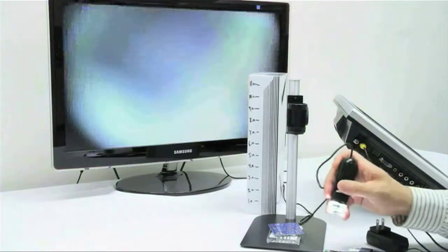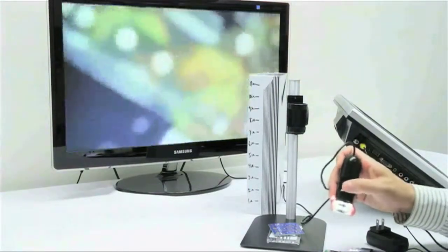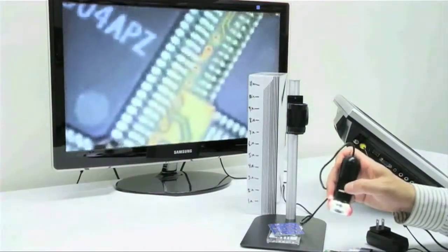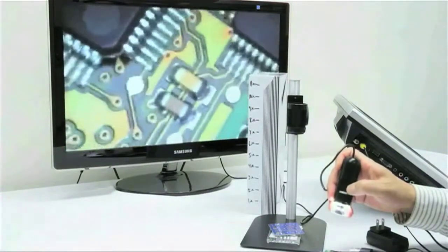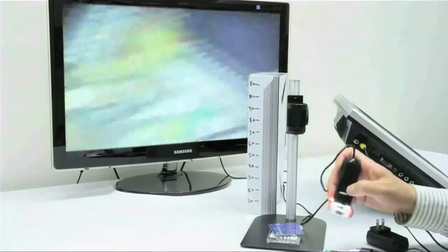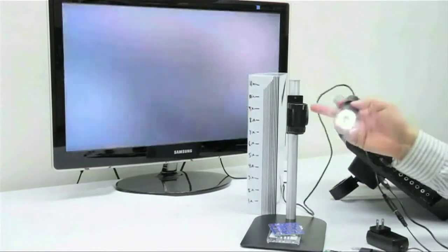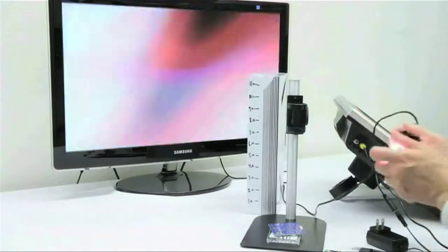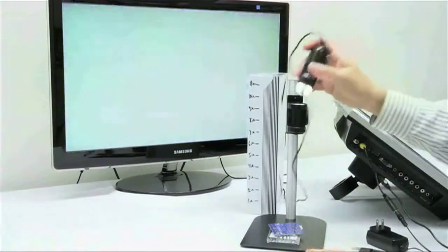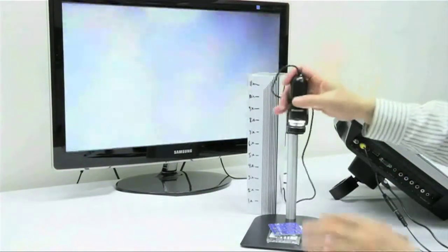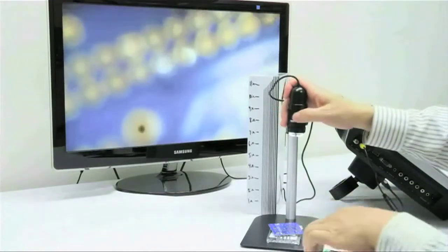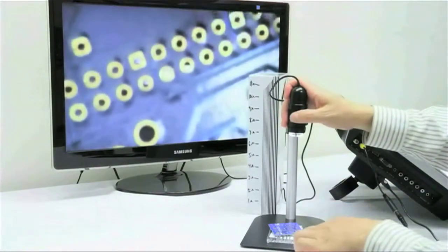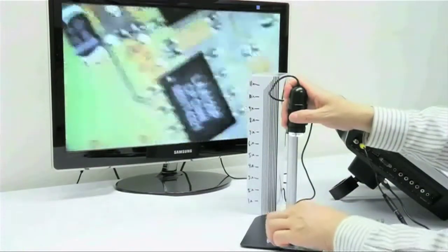You can also use this unit as a handheld device, but because of the higher magnifications at longer working distances, it may be a little hard to keep stable. For this reason, we do recommend using a stand with this scope and we are using the most popular MS-35B.